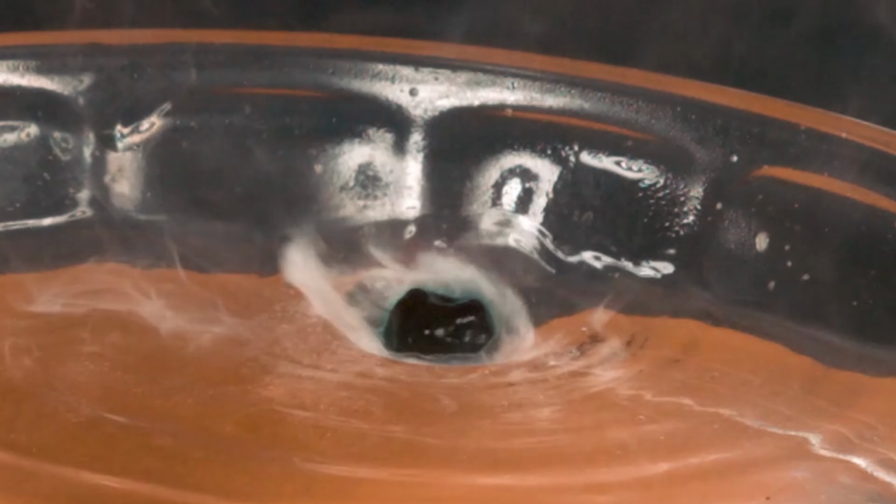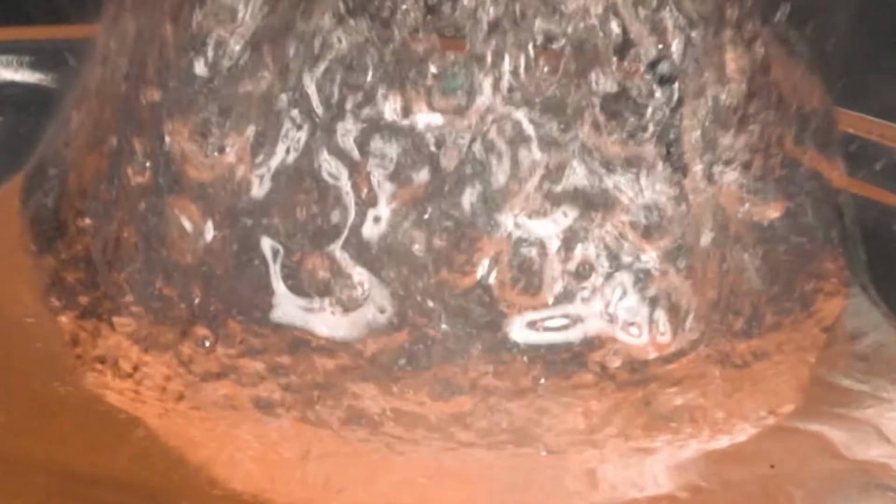The more I think about it, I think the potassium color of the flame is much more beautiful with greens here. You can see a little green and also that purple, whereas the sodium is brighter and more impressive looking because it's so bright. When you look closely here, for the first time I can see not only the violet but a distinct greenish, almost like an aqua flame here. And it gets more and more intense and more irregular, and then suddenly out of nowhere the explosion happens and then again shoots water and shrapnel up into the air.